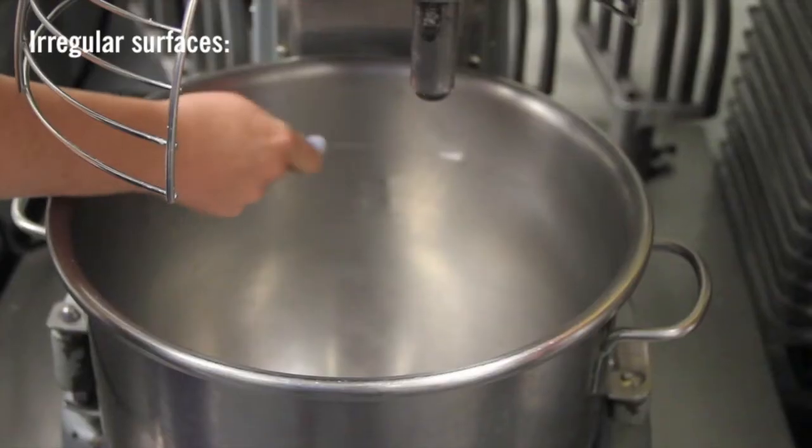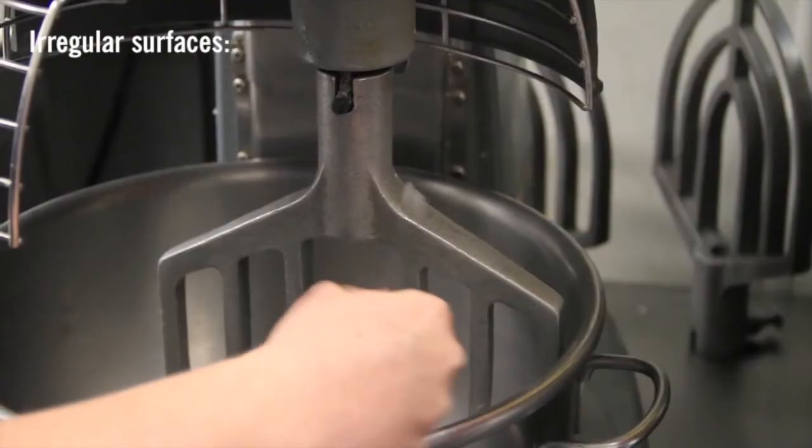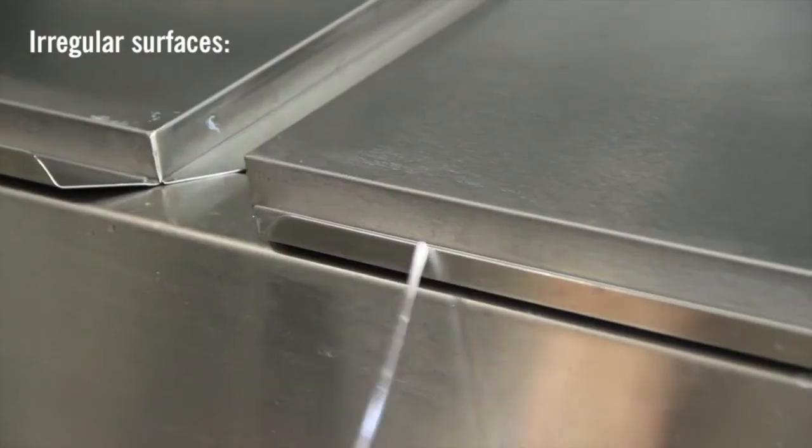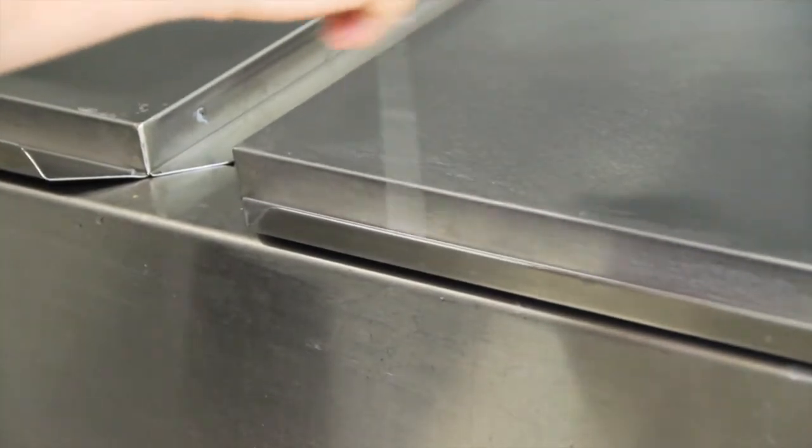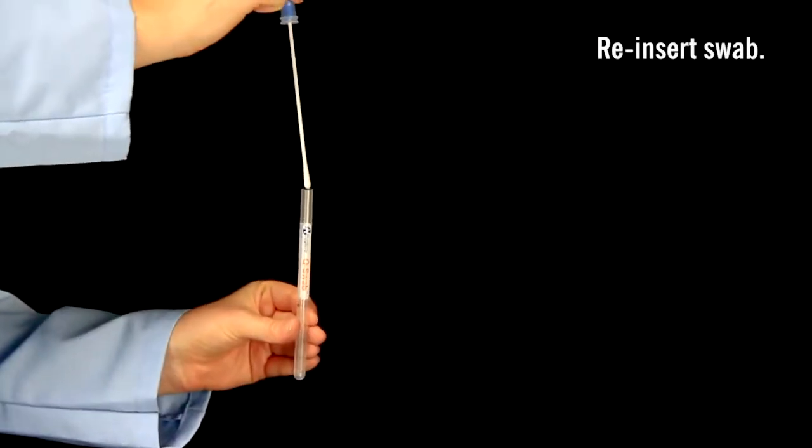When swabbing an irregular surface, ensure the swabbing technique remains consistent and swab a large enough area to collect a representative sample. Replace the swab in the tube.